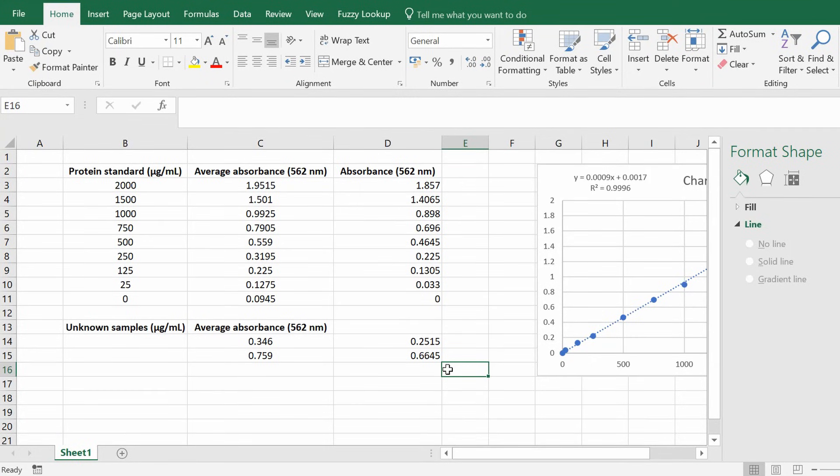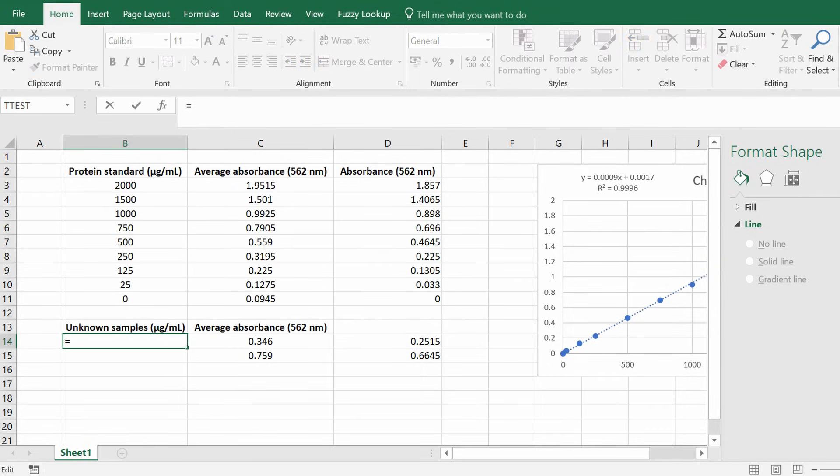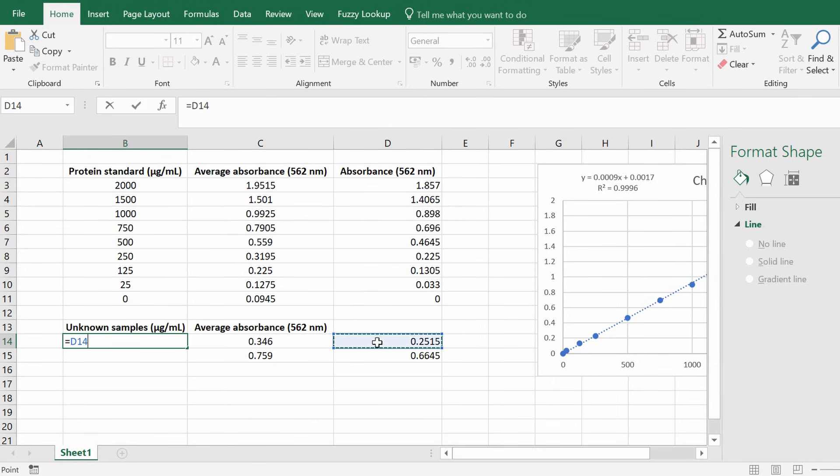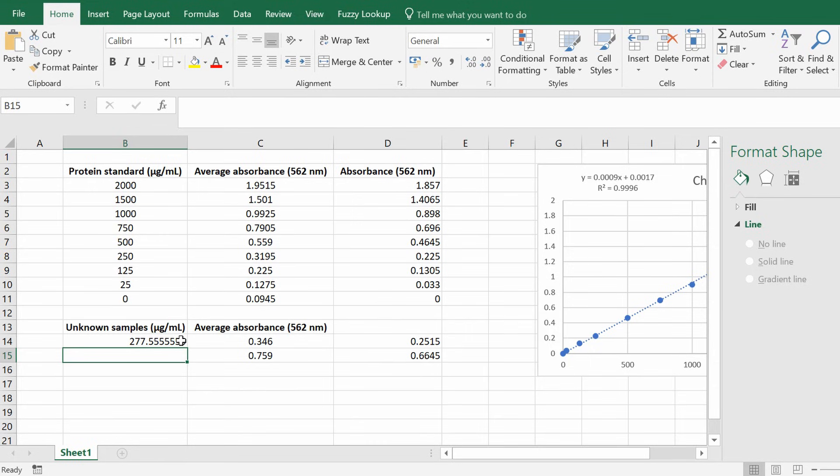So now we have the equation rearranged we can now find out what our unknown samples are. So to do this I'm just going to enter the first sample in the first cell of the unknown samples box and I'm going to click equals and then I'm going to select the absorbance value which has been background corrected for the first sample. So this one's 0.2515. Then I'm going to minus, remembering from the rearranged equation minus 0.0017. Then I'm going to put all of that in brackets and then divide all of this by 0.0009 and then click the enter key.